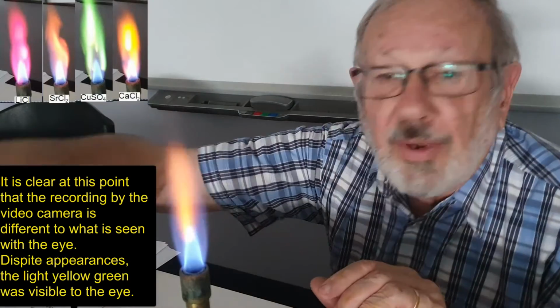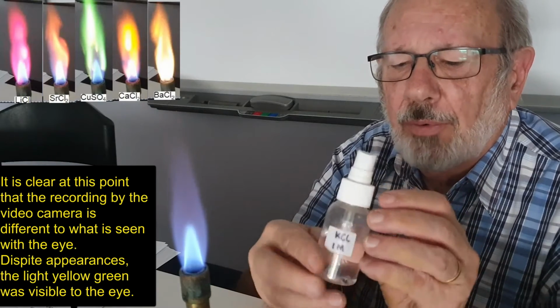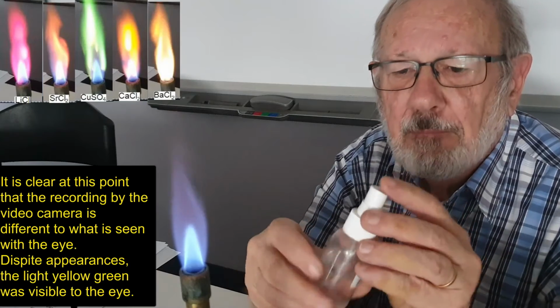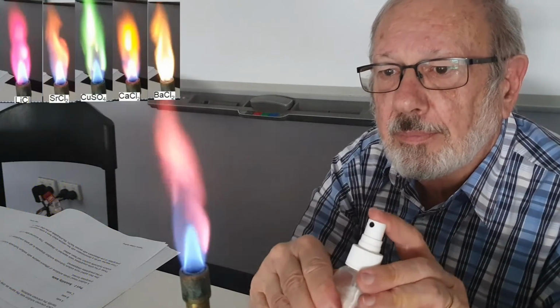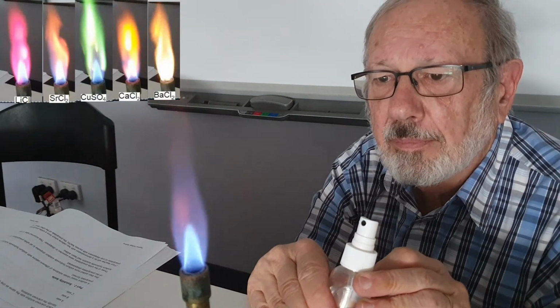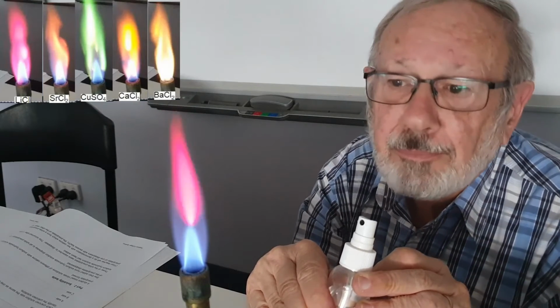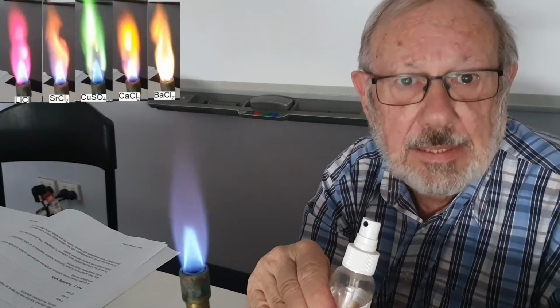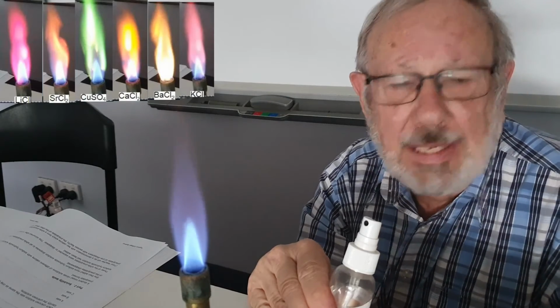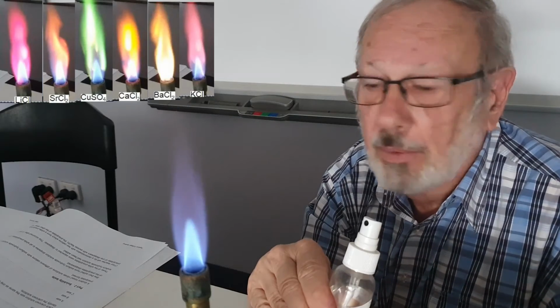Now, our next one is potassium chloride, and the formula for potassium chloride is KCl. Now it's an interesting colour. It's kind of violet or purple. The word indigo has also been used to describe that colour, indigo.